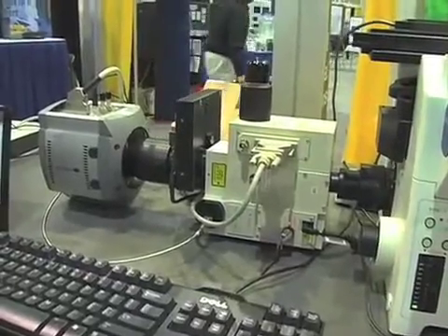I'm Alia Merla with BioCompare, and I'm here today with Mark Brown from Andor Technology. Good morning. So I see you have an imaging system here — can you take me through a little bit of this?